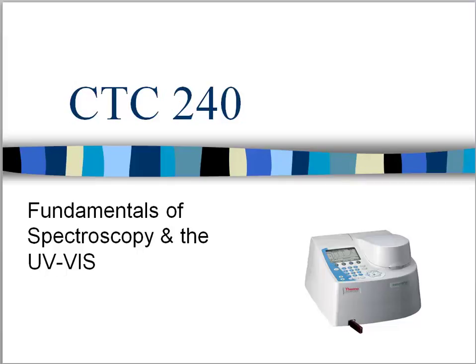Okay, so welcome back to the second video of the first portion of ultraviolet visible spectroscopy. In the previous video, we learned a little bit about what the UV and the Vis stood for in the actual name of the instrument. UV represents ultraviolet and Vis represents visible. And we said that this is a spectrometer. So a spectrometer is a meter that measures light, and the light that this instrument uses is a UV and visible portion of the spectrum.